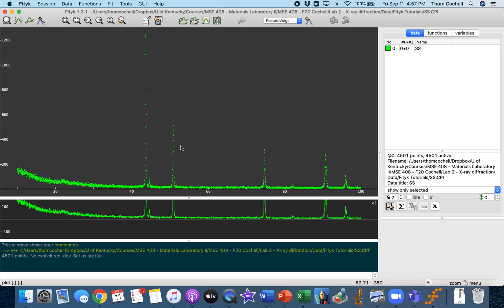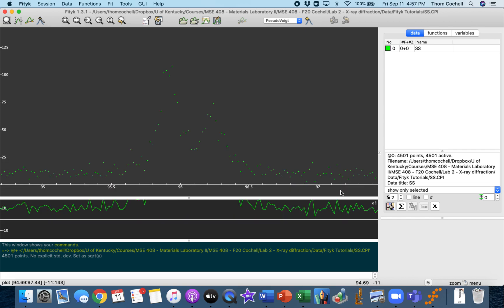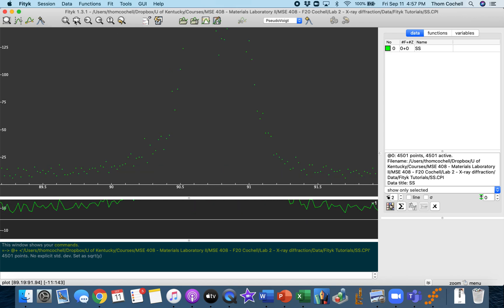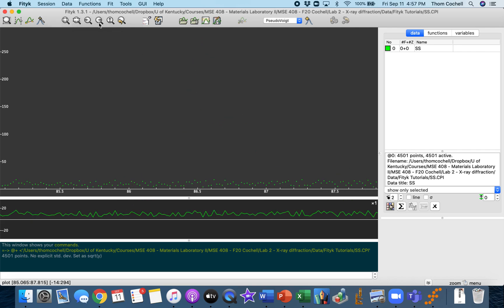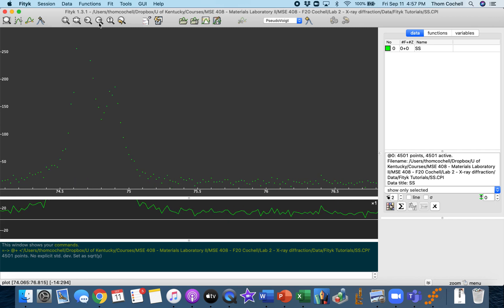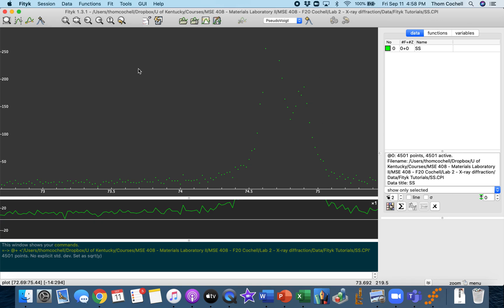If I look at these the way they appear now — the way you probably see it in Excel — you might just see one peak here, one peak here, one peak here, one peak here. But if we zoom in to this last one, it looks a little fuzzy at first. But when you look closely, it clearly looks like two peaks that are very close together. And if you go to some of these other ones as well and use the zoom to fit vertically, you can see it's clearly two peaks.